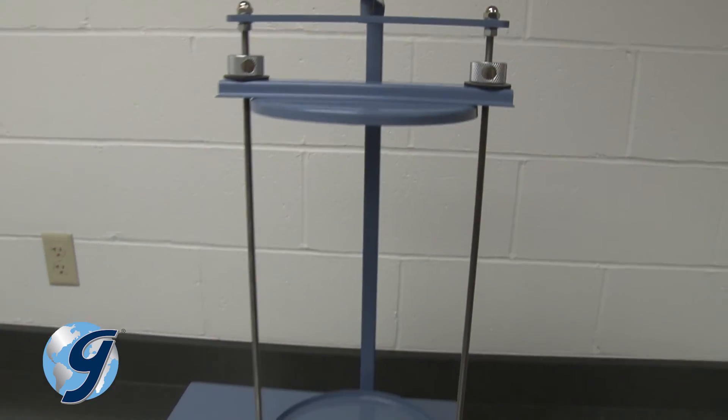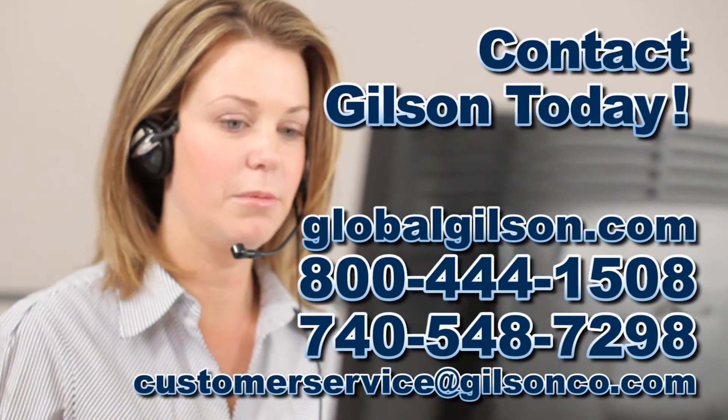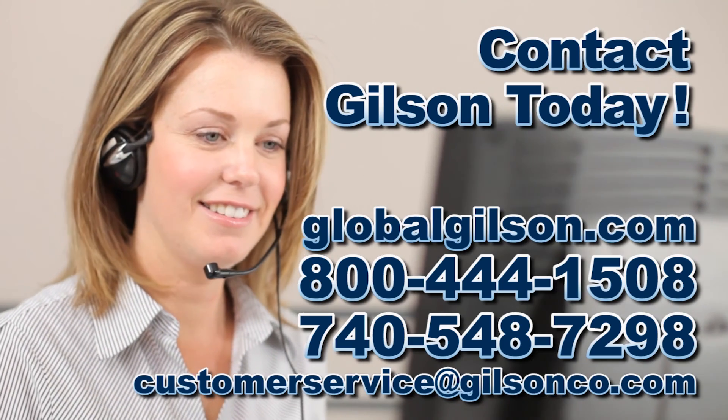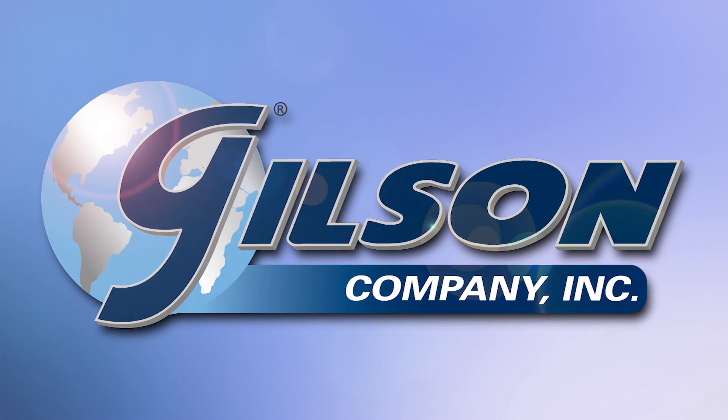For any questions concerning upgrading your existing Gilson SS15 8-inch sieve shaker with the Easy Clamp system, or for any other Gilson product, please contact the Gilson Technical Support Team.